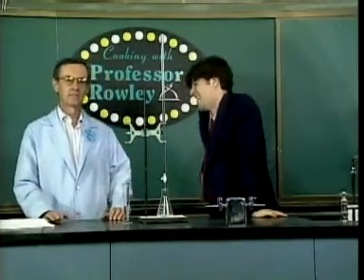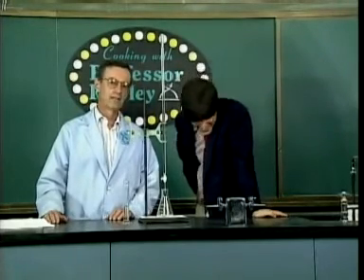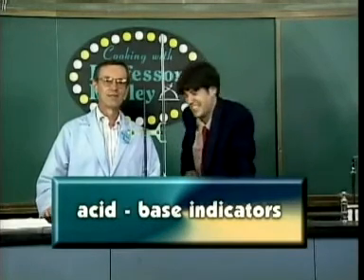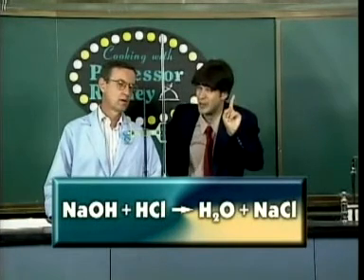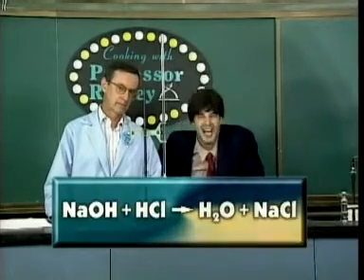When we mix a basic solution with an acidic solution, we'll know that we've reached the equivalence point when the mixture becomes neutral. We use dyes known as acid-base indicators to figure out the equivalence point. Acid-base indicators, ladies and gentlemen. You heard it here first. Okay. The balanced chemical equation is my recipe. It says right here that we need to mix 1 mole of hydrochloric acid with each mole of sodium hydroxide if our recipe is going to turn out right.